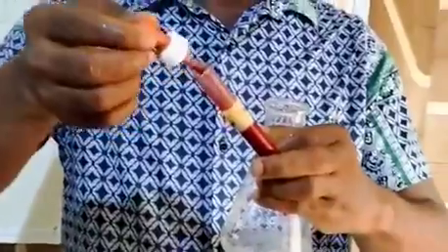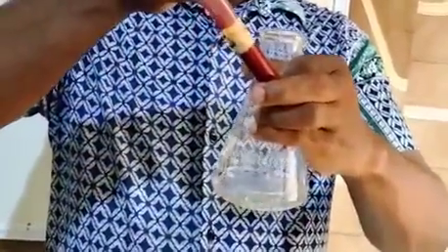So after that, you just drop it and remove it. Don't blow the last drop. It's a precaution. Then you have your methyl orange, freshly prepared. We'll collect with the dropping pipette. Deliver 2 drops and then the 3rd drop. Since we started with three, I will continue to use three all through. Be consistent. Three with three, so I'll have to continue to use three. So I have to shake it. It has a yellow color, bright yellow color.